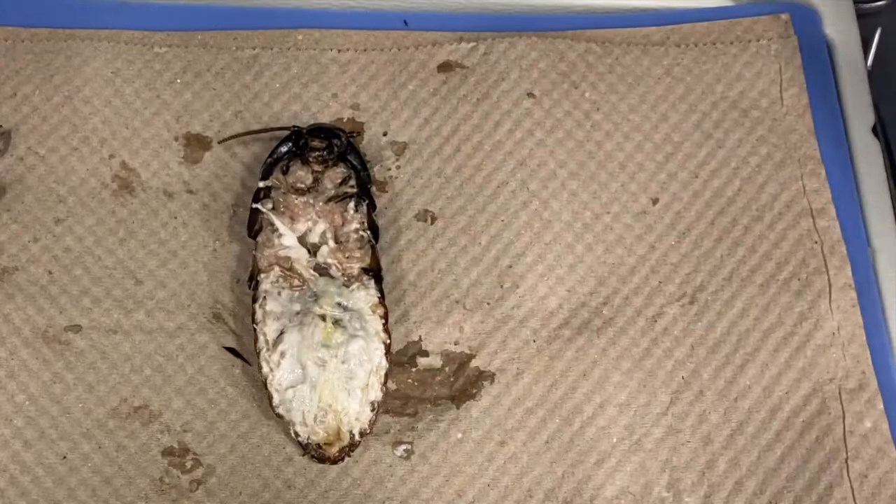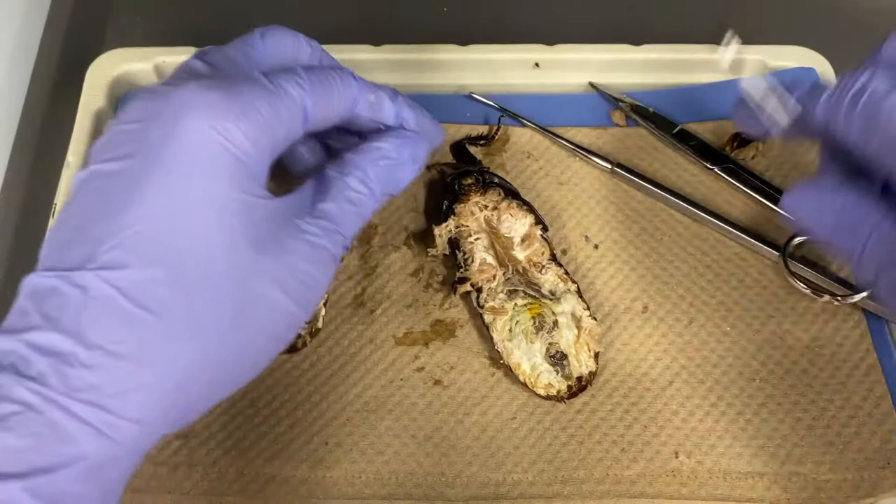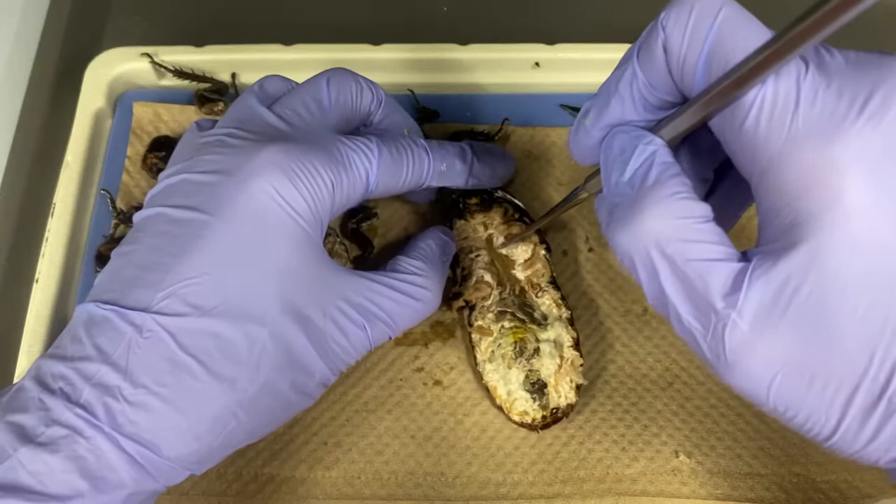The whitish matter surrounding the gut that is now visible is the fat body. If it makes things easier, you can use pins to secure the cockroach in place like this. Before removing the fat body, it is best to locate the other structures so as not to damage any of the organs.